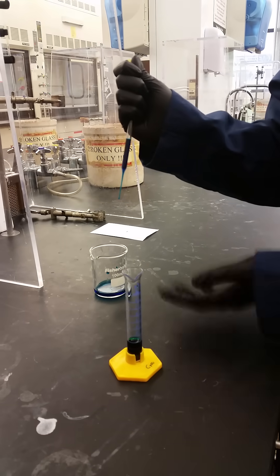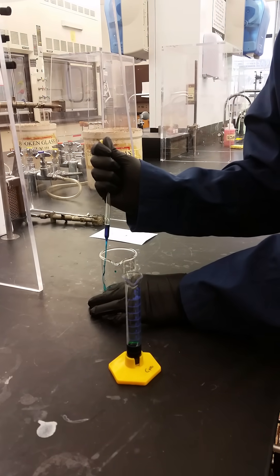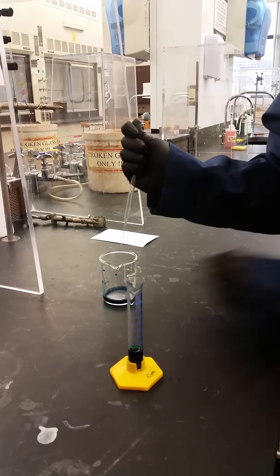Keeping it straight up and down and then placing it in my new container, putting it against the side and releasing the volume into the new container.